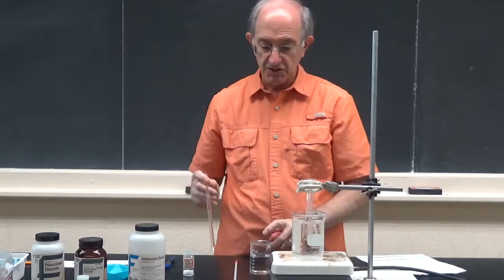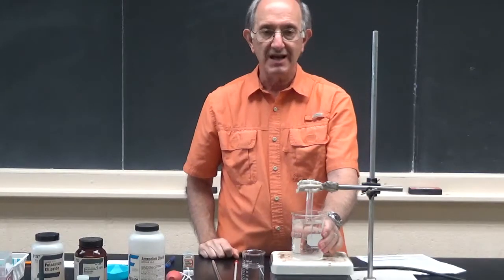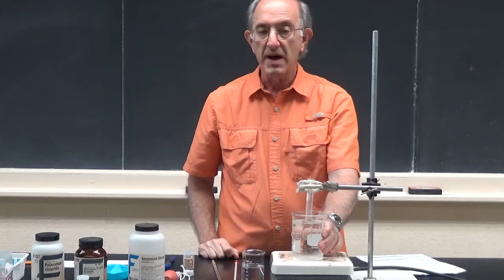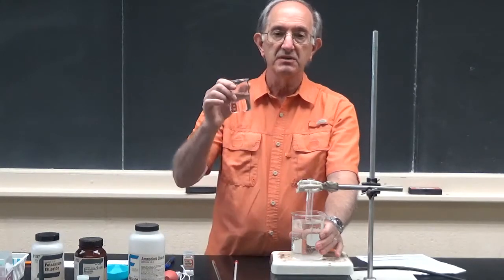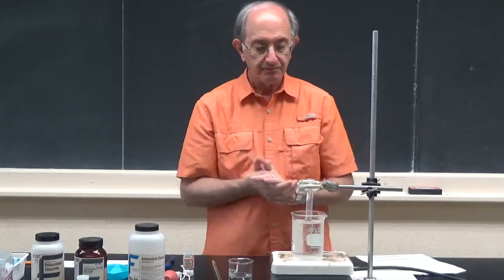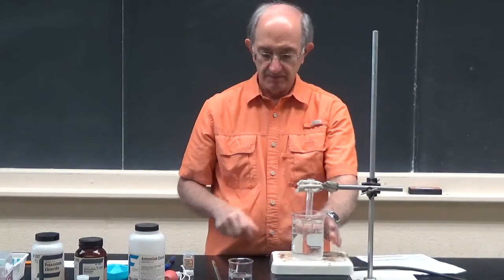You're going to place the test tube in a water bath sitting on a hot plate. This water does not have to be deionized water. It can be tap water. It doesn't matter. Any water that comes in contact with your experiment needs to be deionized from the jugs. So you're going to boil this water.